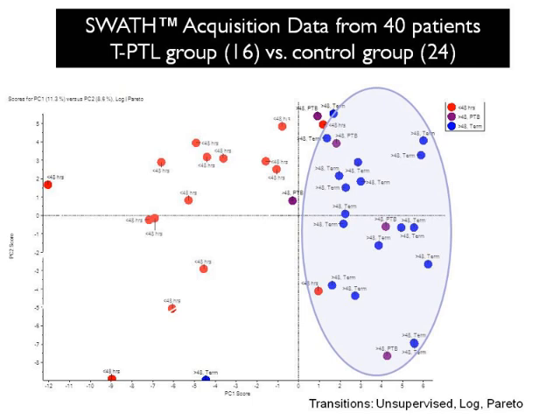Now, we have not taken these biomarkers into a clinical trial. This is just suggestive, so I don't mean we found them, but these are really intriguing data. And of course, we can now target these individual proteins that we think are implicated in being markers for threatened preterm labor and turn them into a validated MRM assay. But I think before we do that, we're going to go ahead and try and tease out more information.